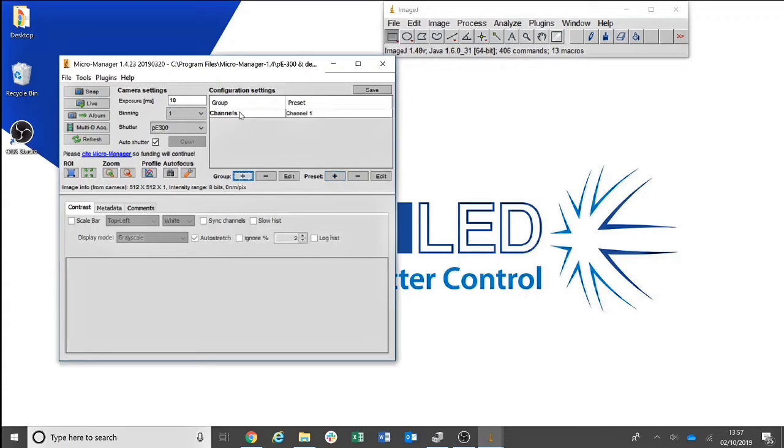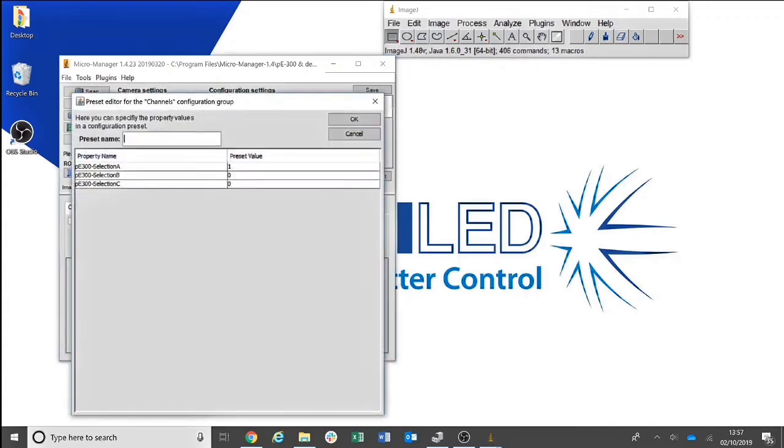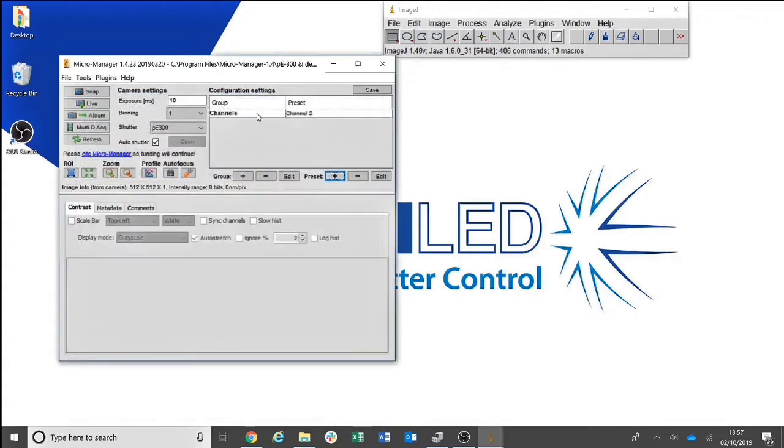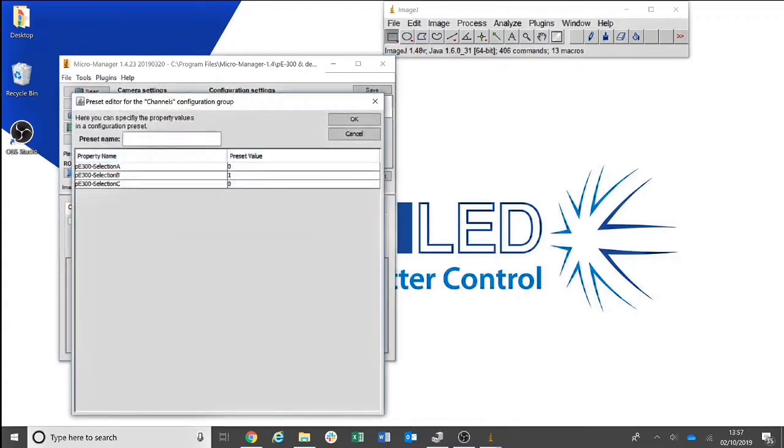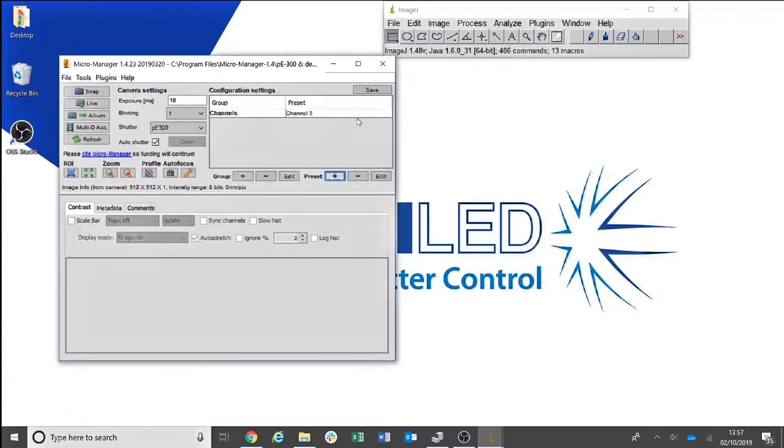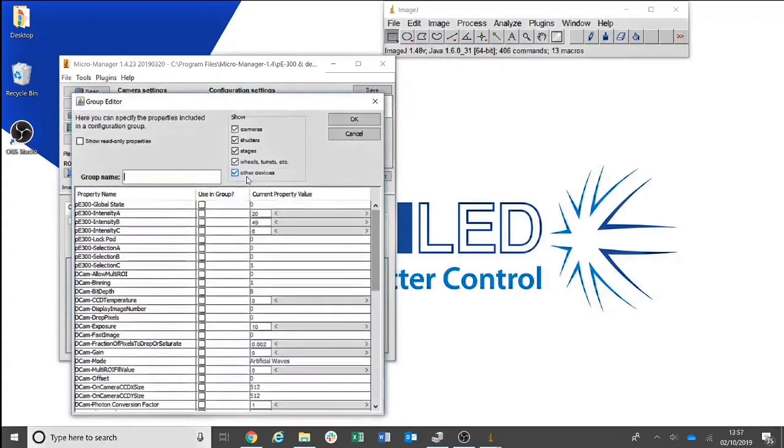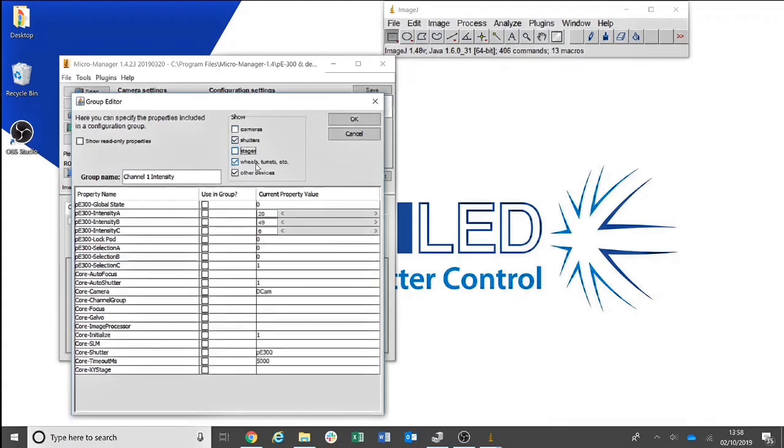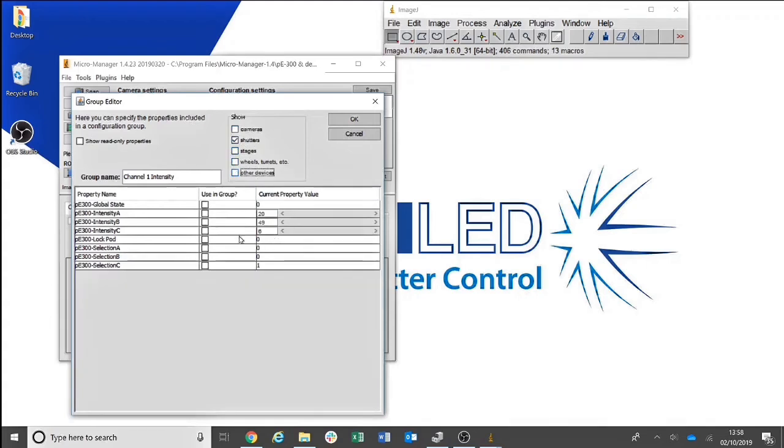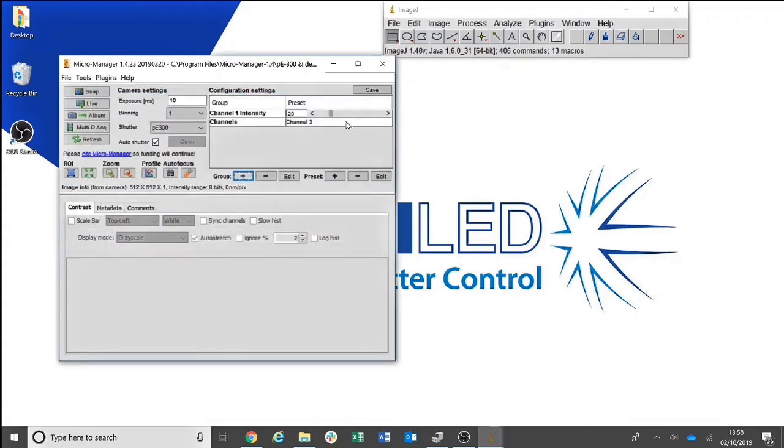You can then select the group and add a preset for Channel 2 and Channel 3. We shall then add a group for Channel 1 Intensity. Again, I will hide cameras, stages, wheels and other devices. You can then select Intensity A and click OK.